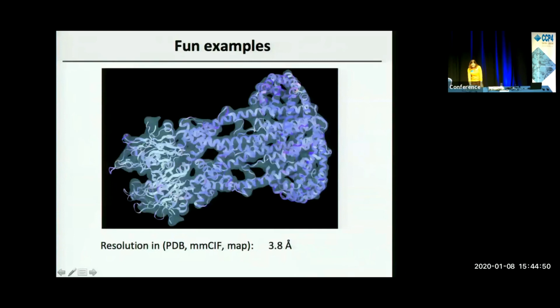The apparent resolution is much, much lower. We estimated the resolution in our statistics step, and this resolution is 7.5 angstrom. So it looks like the deposited map is probably not the map which has been used for refinement.